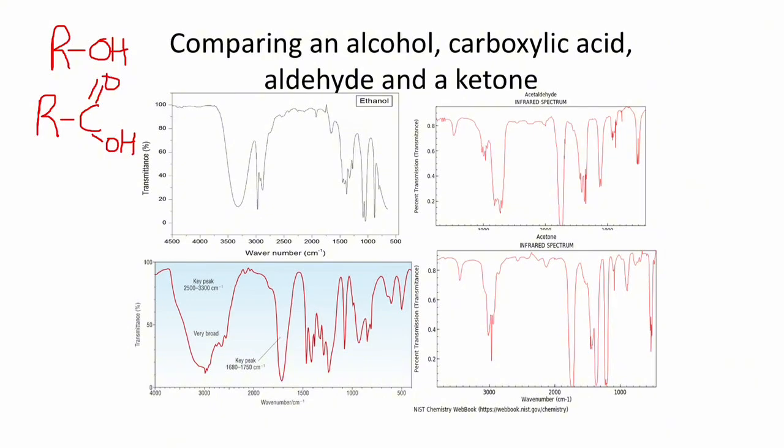If you were to find the wave number associated with this peak, you would match your peak region to your wave number on your IR spectrum, and then do the same for your OH group in your carboxylic acid. Because it's very broad, sometimes you may get a bit of a range for the OH group of your carboxylic acid. This region here is typically your carbon to hydrogen functional group peak.